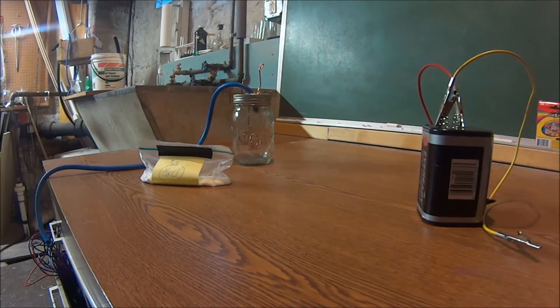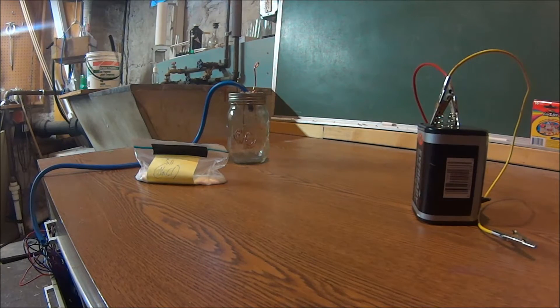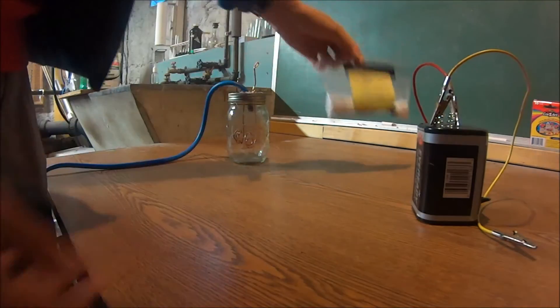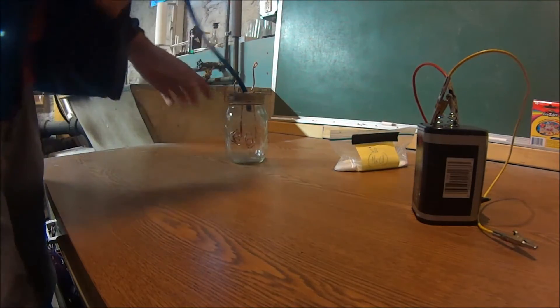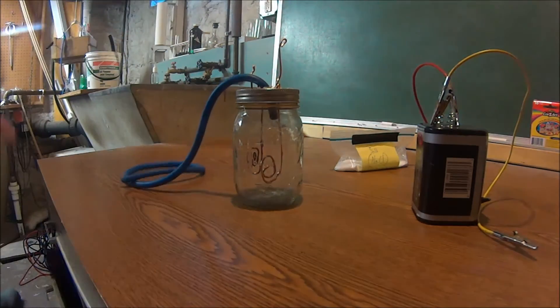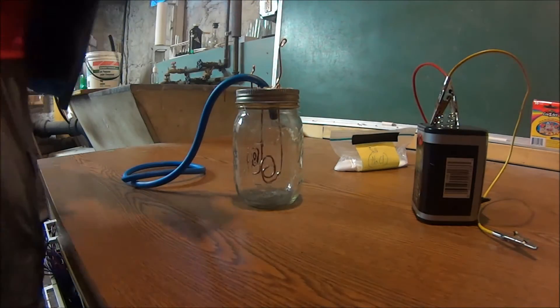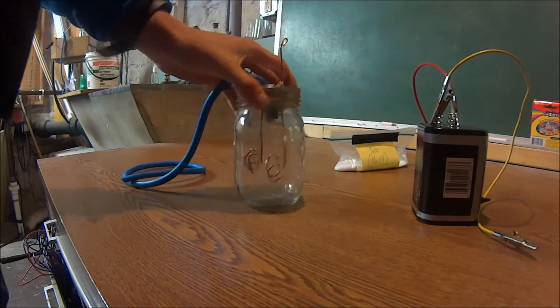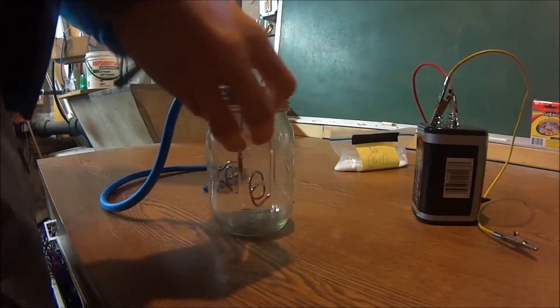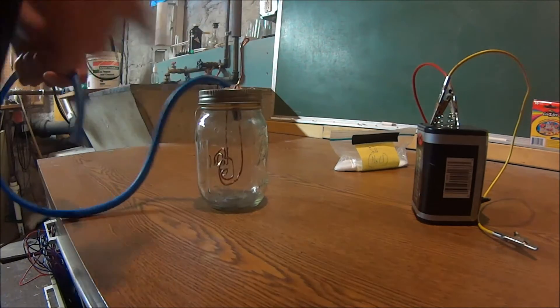Hello everyone. Today we're going to be making hydrogen. We're going to do electrolysis on some salt to make lye, or sodium hydroxide, and then we're going to react the sodium hydroxide with some aluminum. And hopefully that will create a reaction and we'll get hydrogen. We'll know if we're getting hydrogen if it bubbles - that would be after we're doing electrolysis.